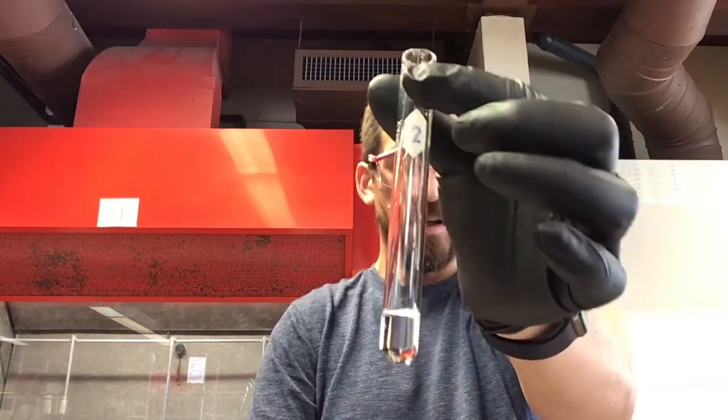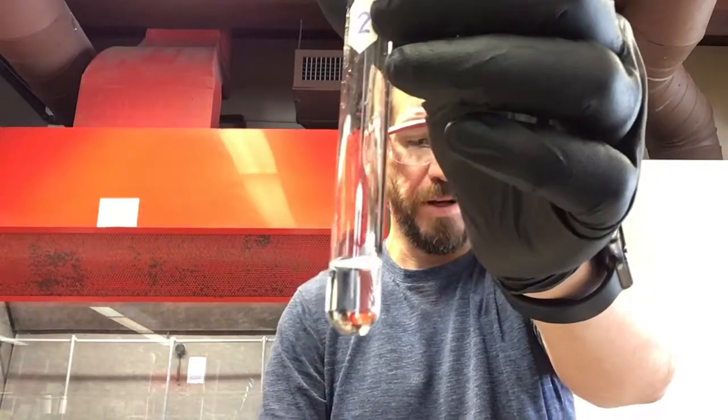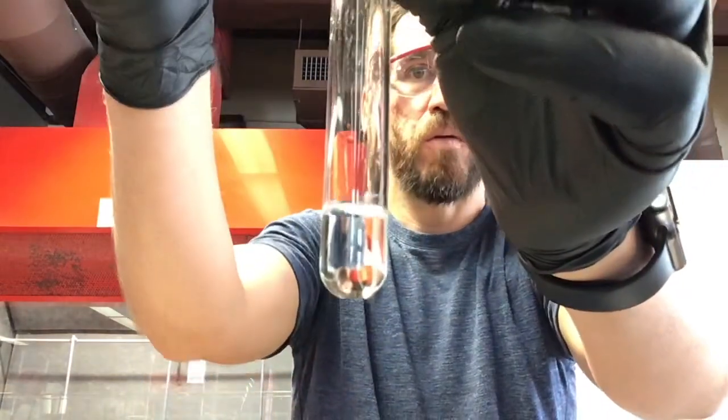Now what we want to do is, number 2 is 2-bromobutane. All right. Let's see. So, same structure, different leaving group, right? Hit that with 4 drops.